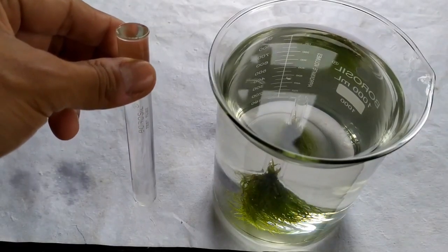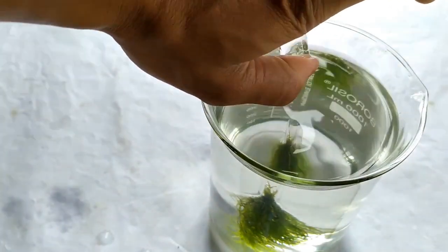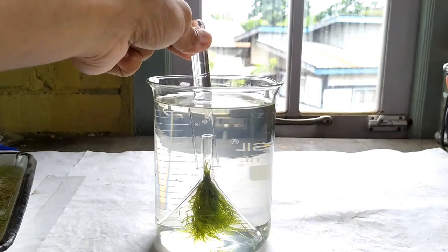Now, fill the test tube to the brim with water. Hold the mouth of the tube with your thumb and invert the tube into the beaker and let it sit over the tube of the funnel as shown in the video.